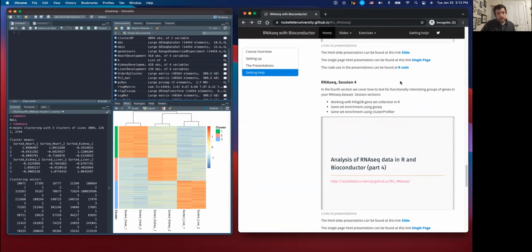Yeah, that's a good point. I feel the most useful workflow would be to perform clustering with a K means of choice and list the top marker genes in each cluster to check whether the clustering makes sense. Yes, that would be a good way to do it for this. We could then see if these liver-specific groups are falling into these specific groups here, see if there's overlap.